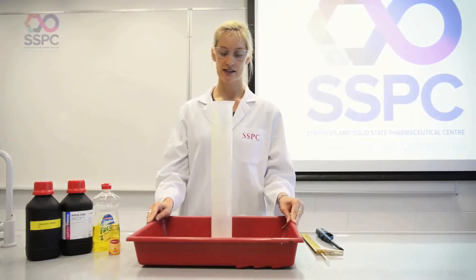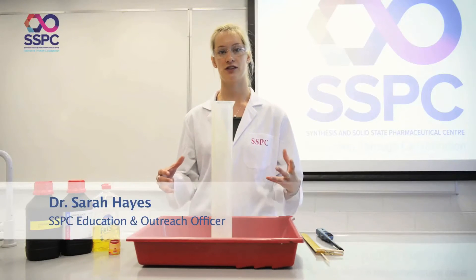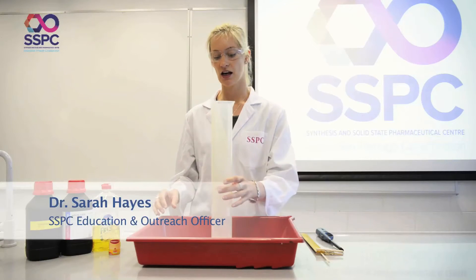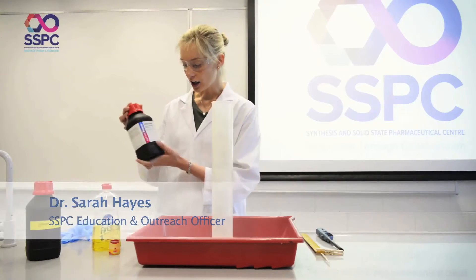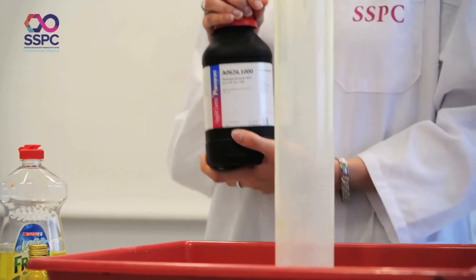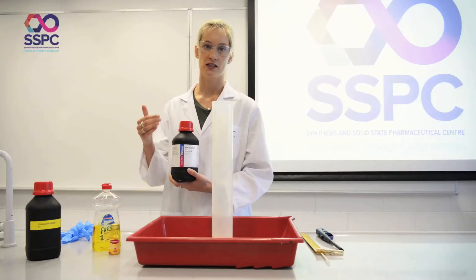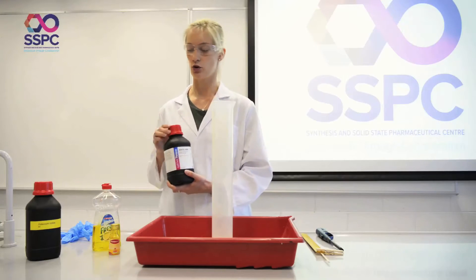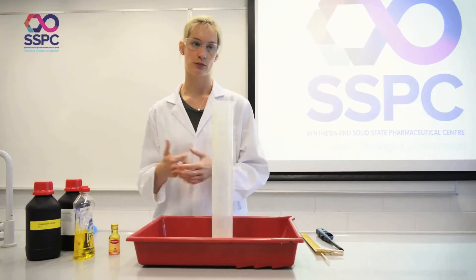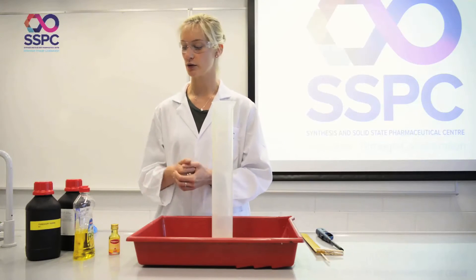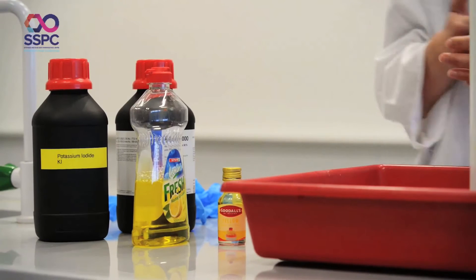We call this experiment either the iodine snake or the elephant's toothpaste. What we're doing here is looking at hydrogen peroxide H₂O₂ and how it decomposes into oxygen and water. In order to speed up this reaction we're going to use some potassium iodide to act as a catalyst.